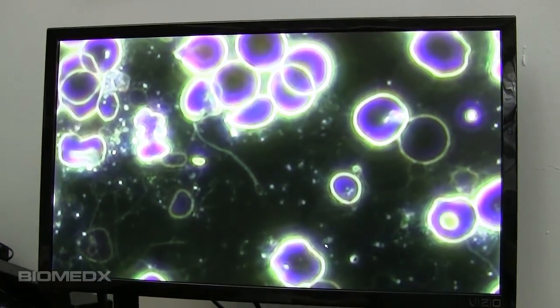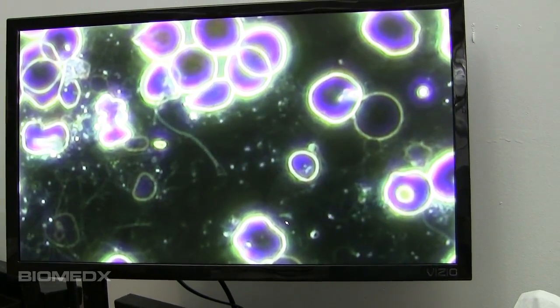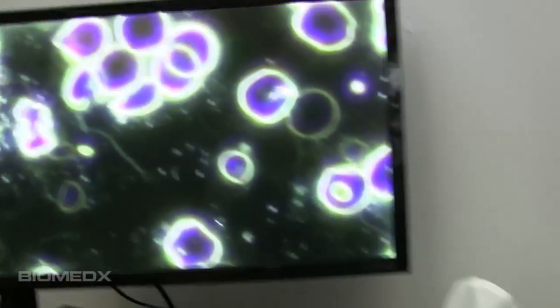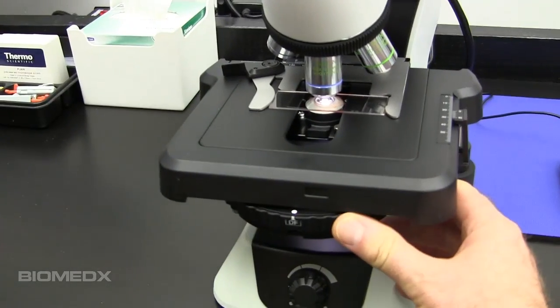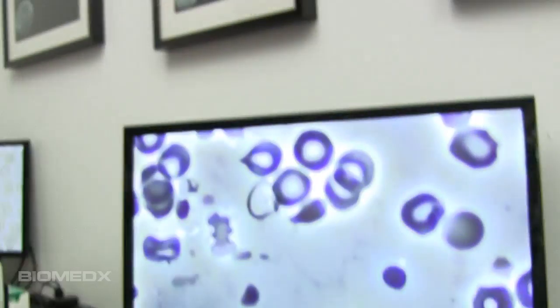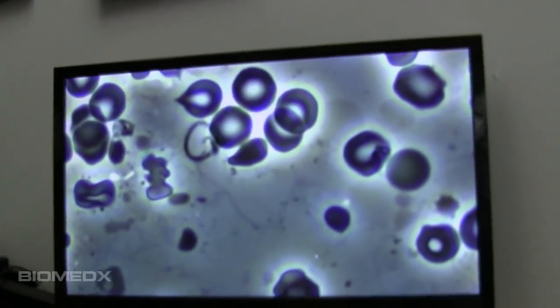This is dark field, 40x, no oil — 40x objective, dual purpose objective. It'll do the dark field, and by simply rotating the universal turret condenser here, I can go right to phase contrast — and there you go, you've got phase contrast.